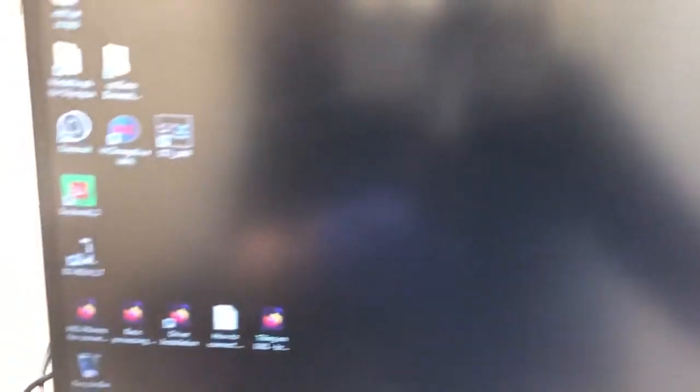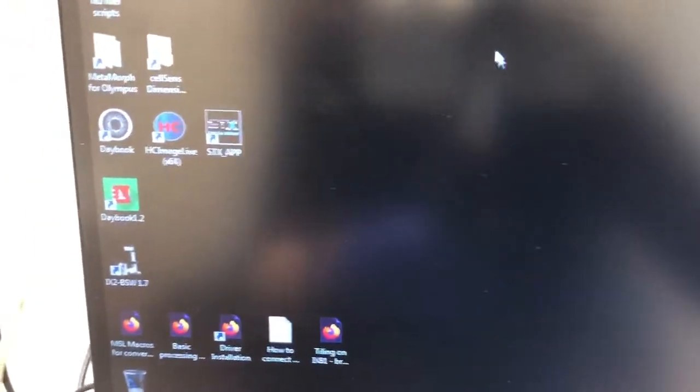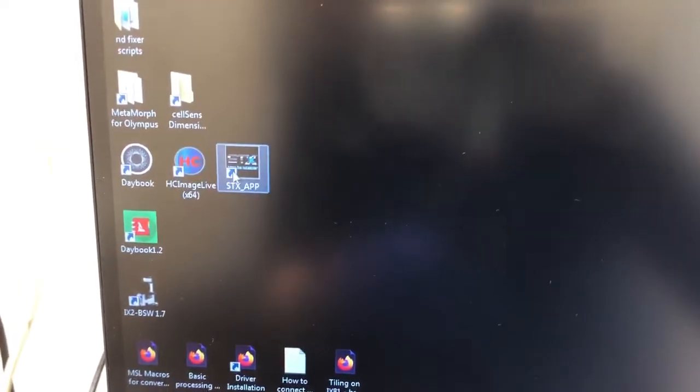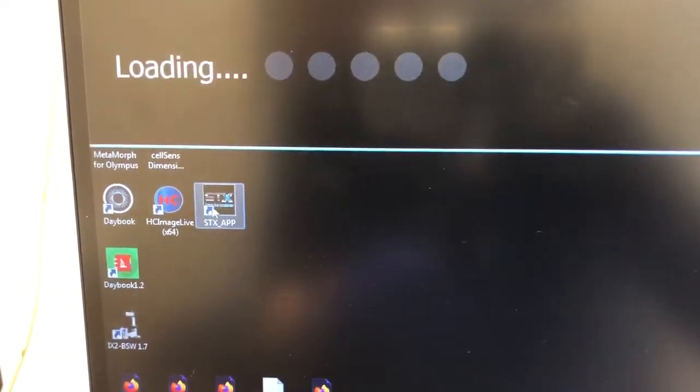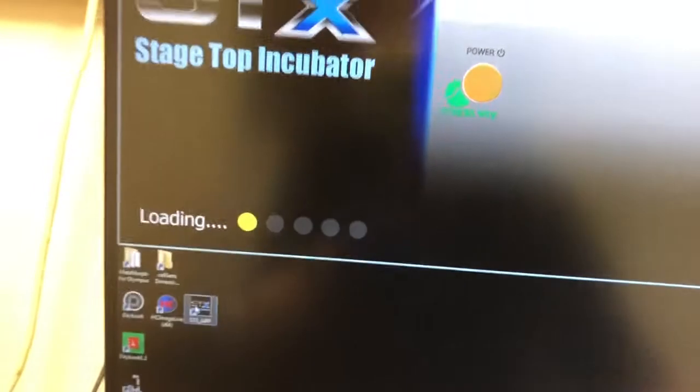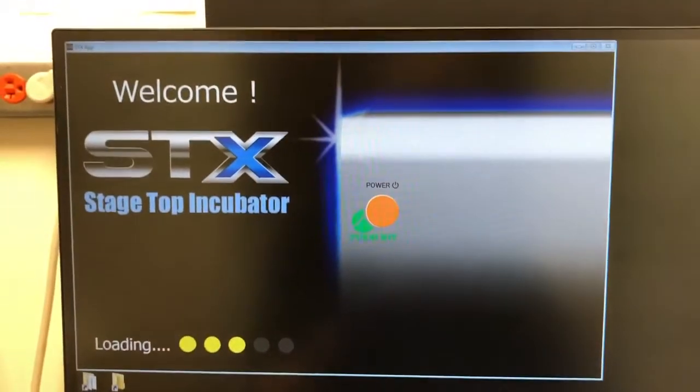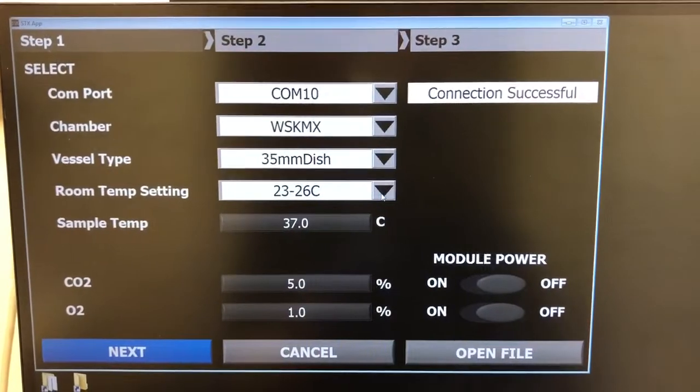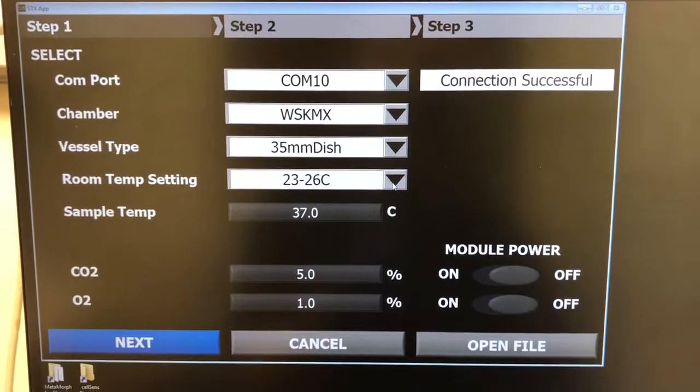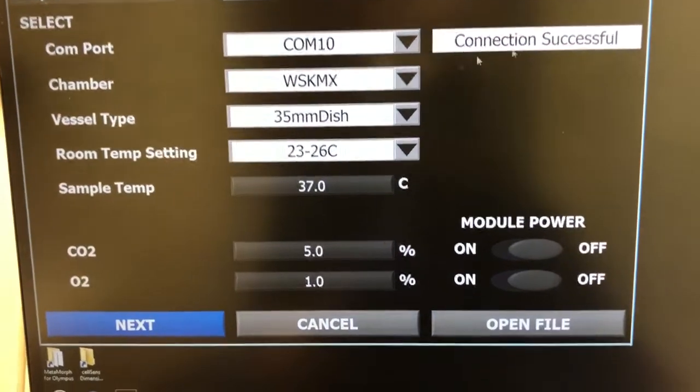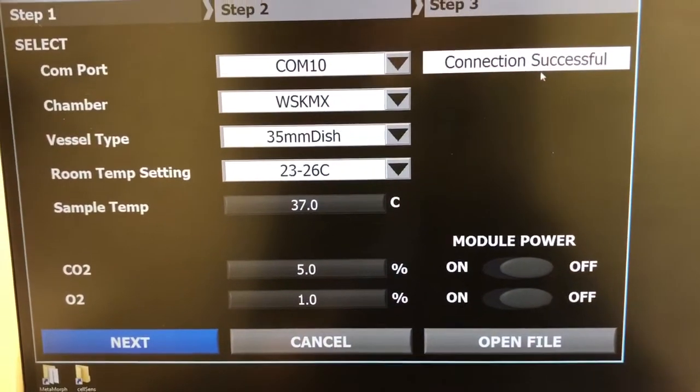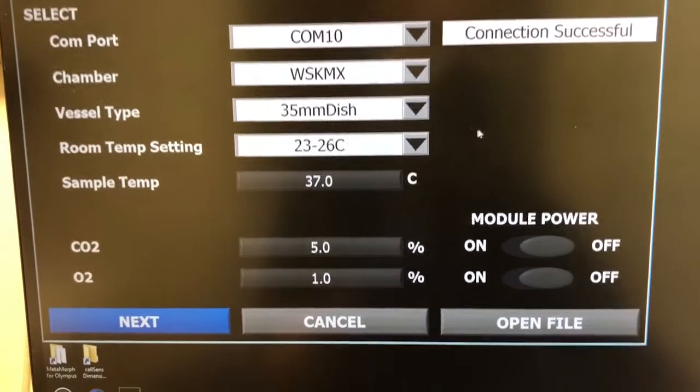Once you have that going, what you need to do is come here to this STX app. And this is the interface that will allow you to measure the sample temperature. Once the system starts up, you get this. The connection should be successful. If not, let me know.